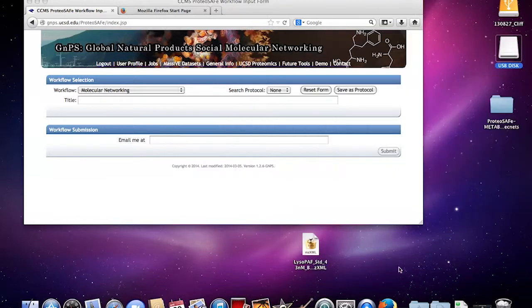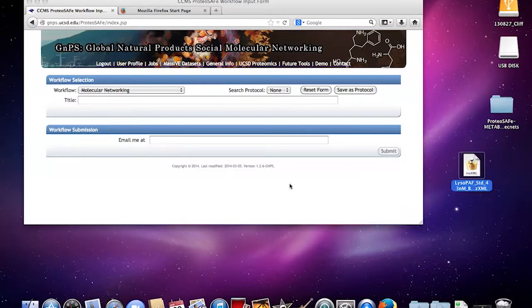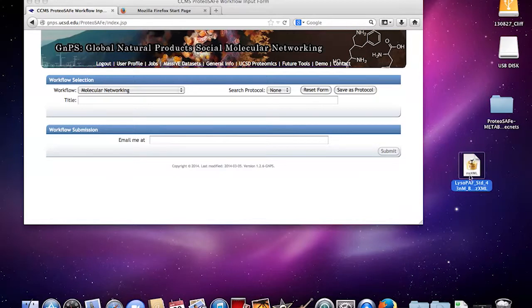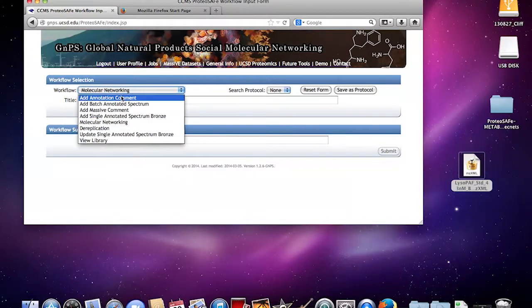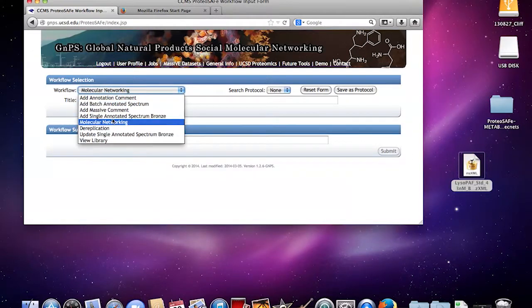This has been converted into .mzxml from my raw file. I got it from LTQFT direct infusion mass spectrometry instrument and I know I got this in the commercial, so I'm going to upload this as a single annotated spectrum in the bronze.